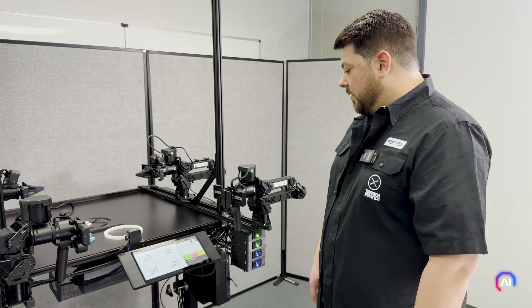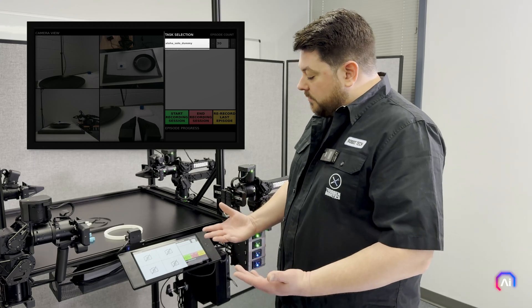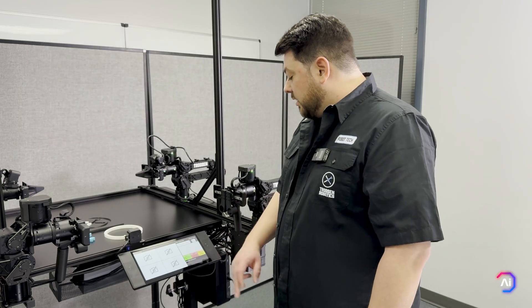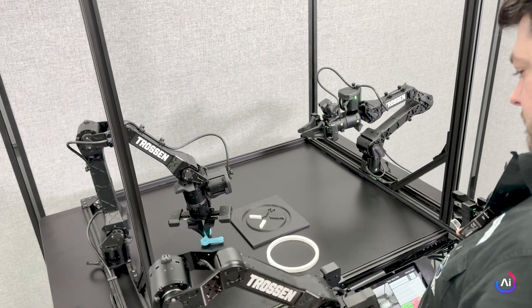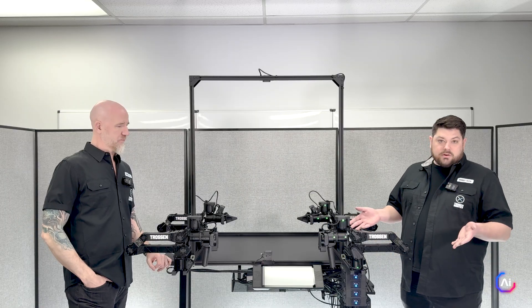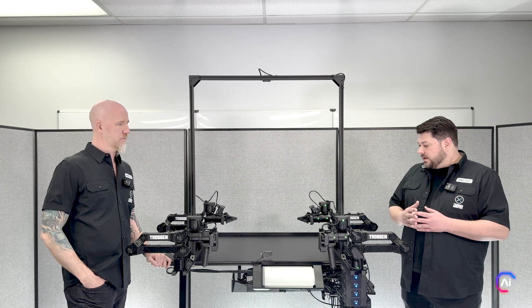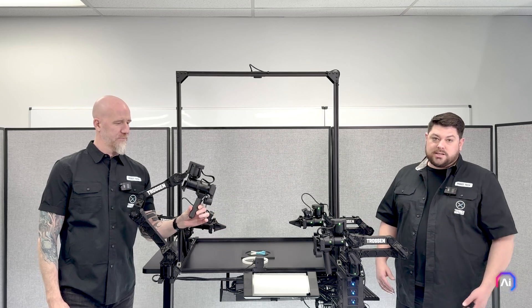Let's show how to collect a session. You'll see four camera feeds, your task selection for any pre-programmed tasks you'd like to do, as well as the number of episodes you'd like to collect per session. There are three buttons: start recording, end recording, and re-record in case you made a mistake. When you hit start, you'll hear audio prompts and a warm-up at the beginning of each training session. On the nitty gritty side, you get 500 Hz control on our custom iNerf controller — industrial level. One of the great features is industrial gravity compensation, making it really smooth for an operator without strain even while collecting up to hundreds of episodes a day.